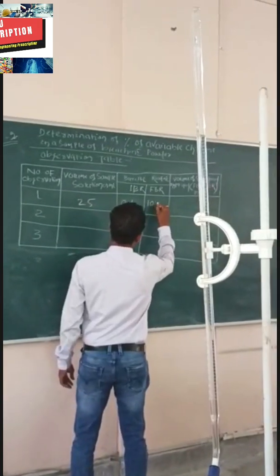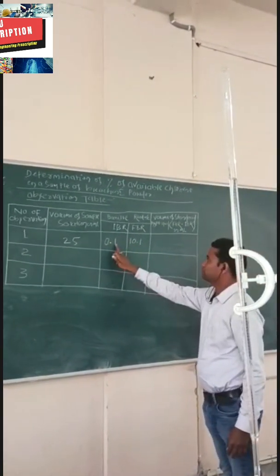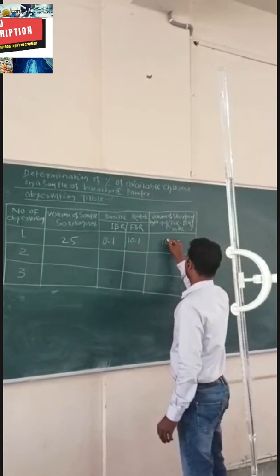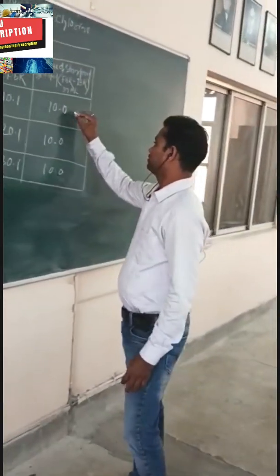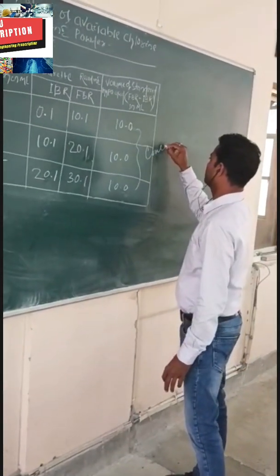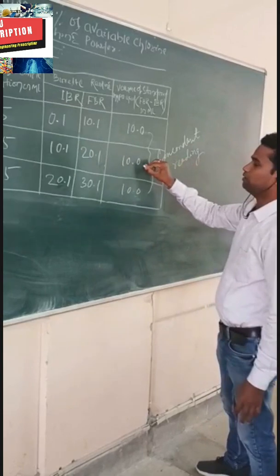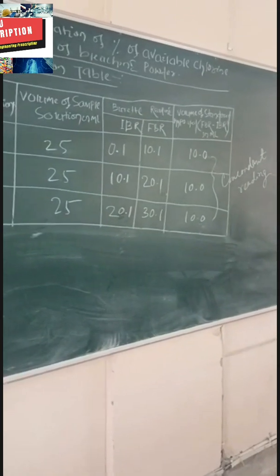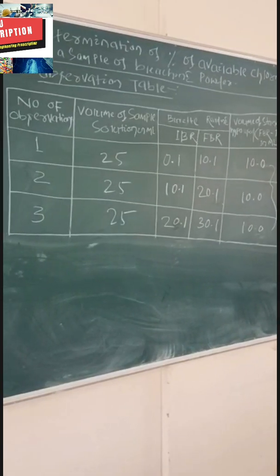The final burette reading is 10.1. Volume of standard hypo solution used = final reading minus initial reading = 10.1 minus 0.1 = 10.0 ml. One reading is completed. I have taken three readings this way. Note the values which will be required for the calculation. Thank you.